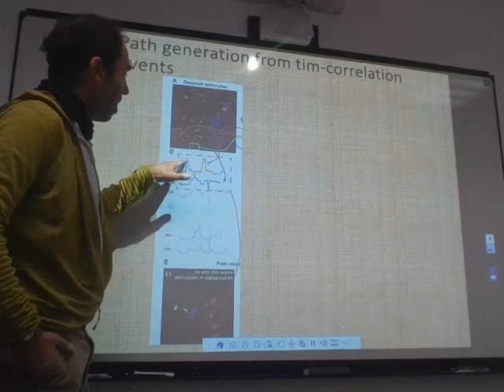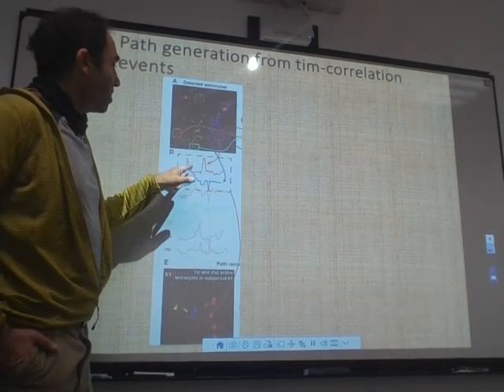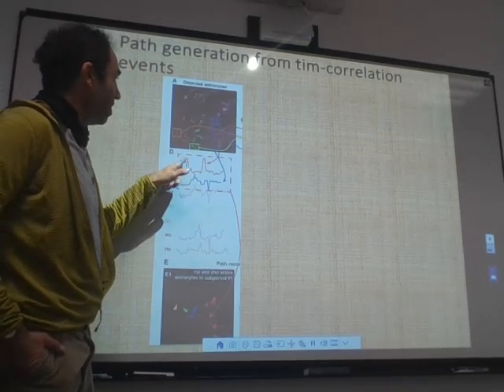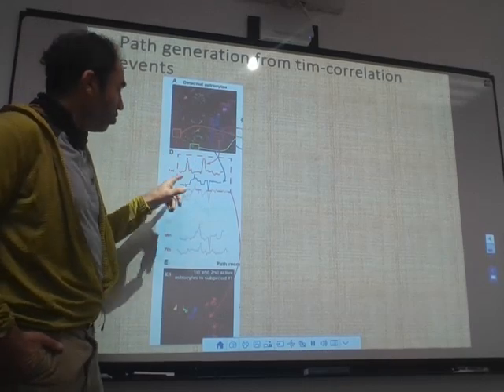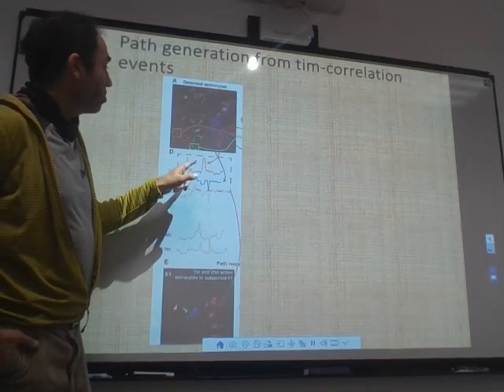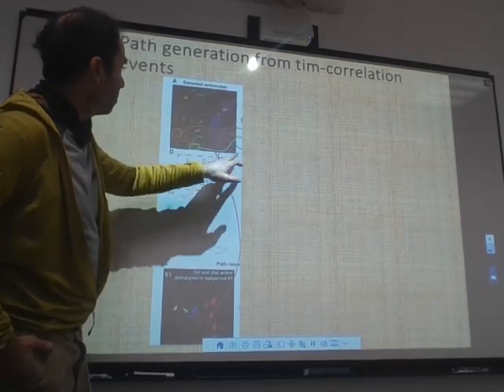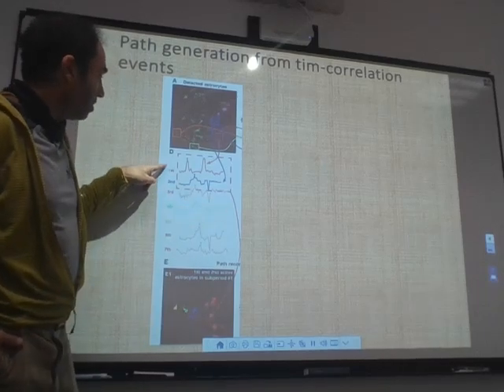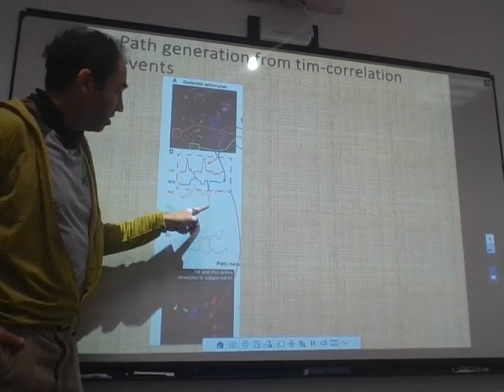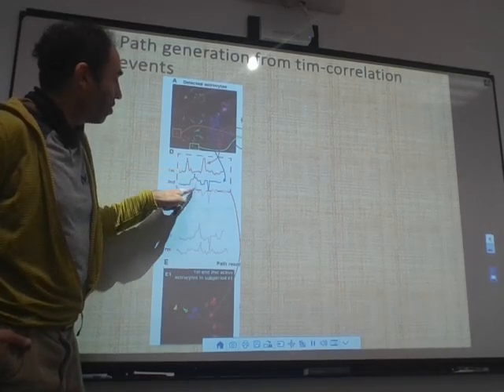You can look at the specific events that are above a certain threshold. For example, this one you don't care about, but this one we care about. And then you look in your distribution, when is going to be the next event? So the next event would be this one, and there's a third one which comes from one of these guys, and so on. So you can repeat. You can order your time series iteratively. Once you have found this one, it becomes the first one, and you look for the next one, and so on.